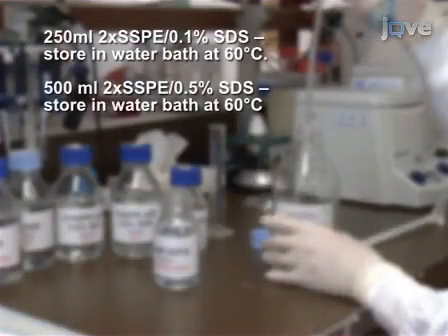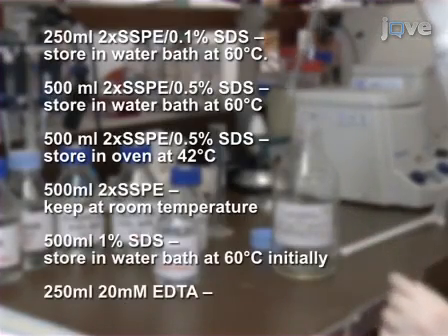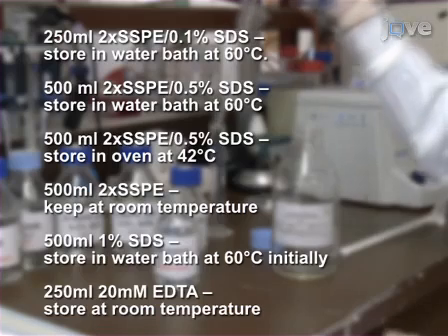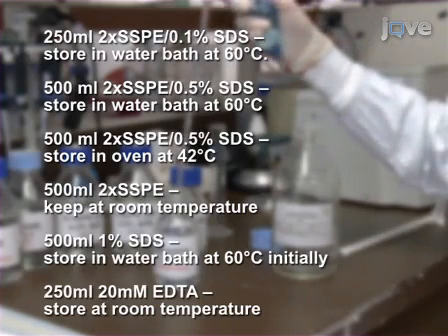Multiplex PCR amplification of the targets of interest is not described in this demonstration but must be performed prior to probe hybridisation. Before beginning the hybridisation procedure, prepare the following solutions according to the written portion of this protocol.